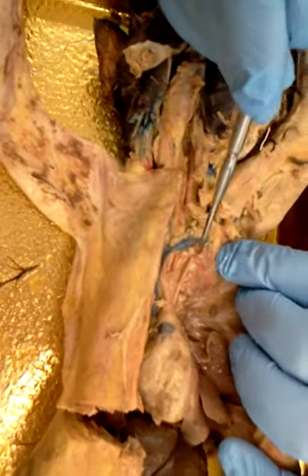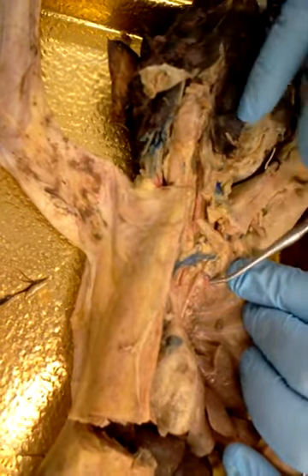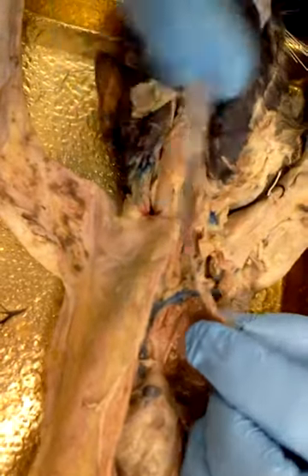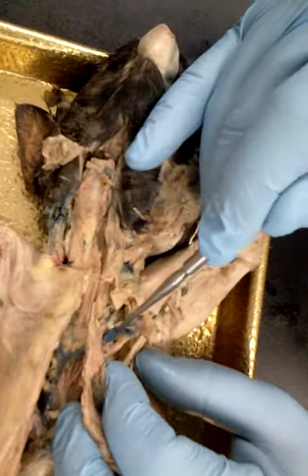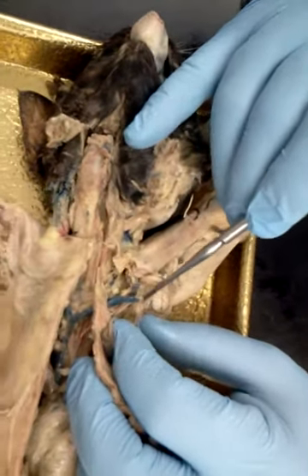this is the left subclavian. Here's the internal mammary. The vertebral goes down to the vertebrae. Once the artery goes through the chest wall, it now becomes the axillary when it gets into the armpit of the cat. The red one, right? The red one. We're talking about the arteries.